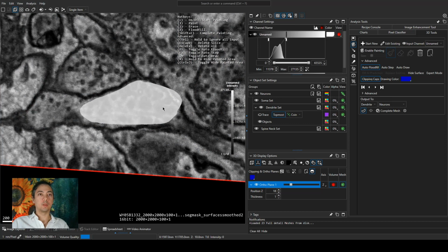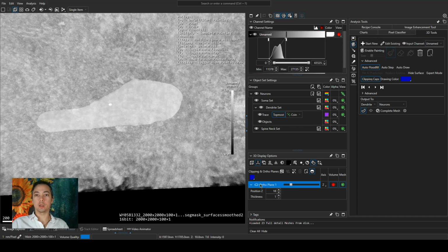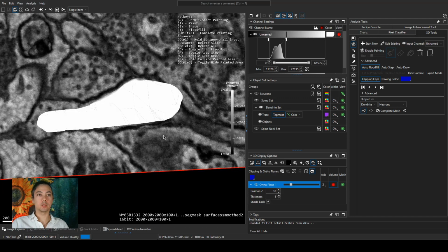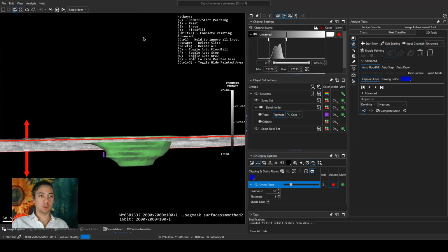Yeah, it's a little tricky because they're all laying on top of each other. But here it is. And if I turn on the trace, and actually, it's probably nicer to just do this. You can see, there it is.